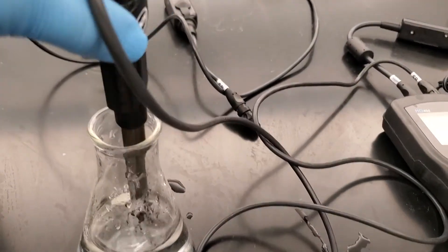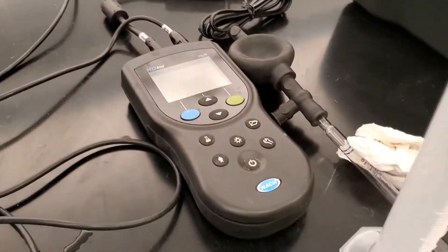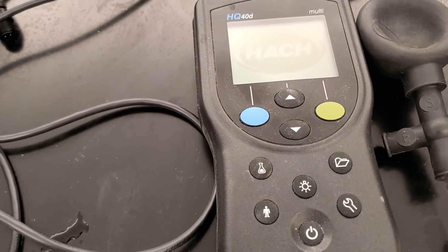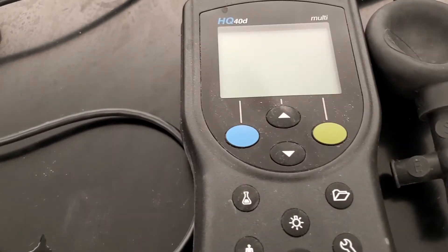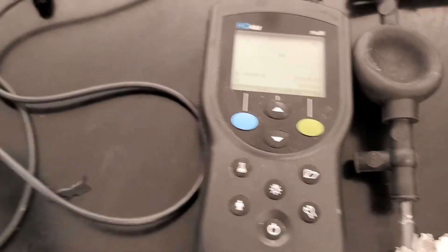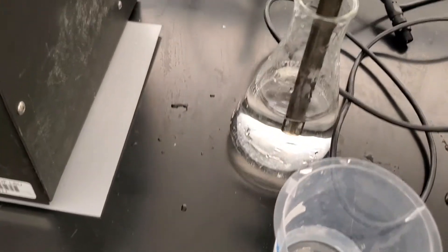This is a probe to measure pH, and this is a pH meter. Turn on the pH meter, take the probe — this is my sample — and put it in.